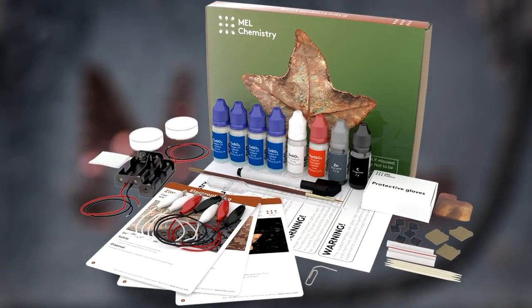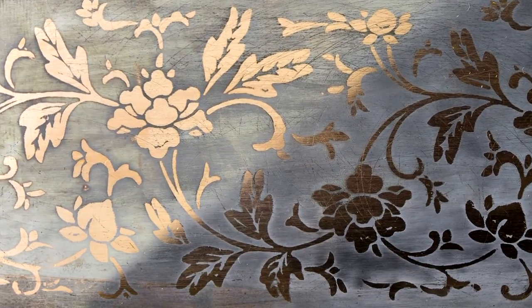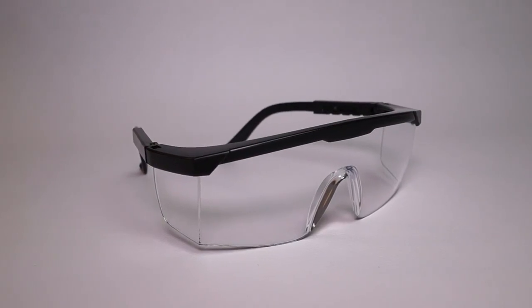This experiment from MEL Chemistry Electroplating Set will deposit zinc on a copper plate, and we will also make beautiful shiny patterns on it.